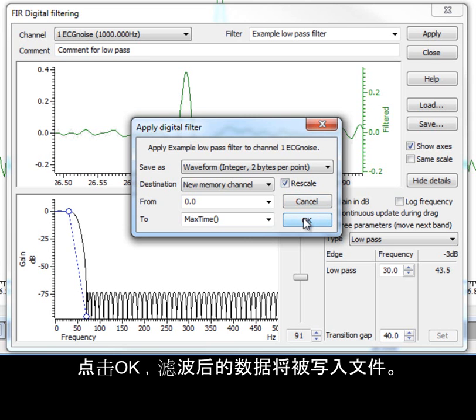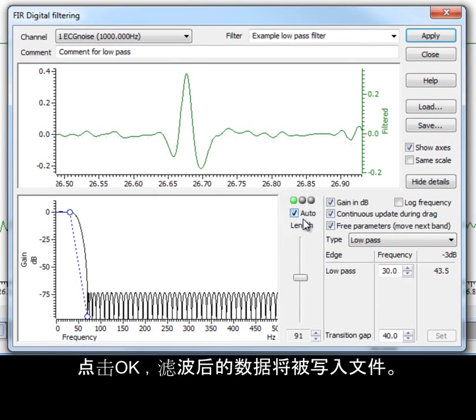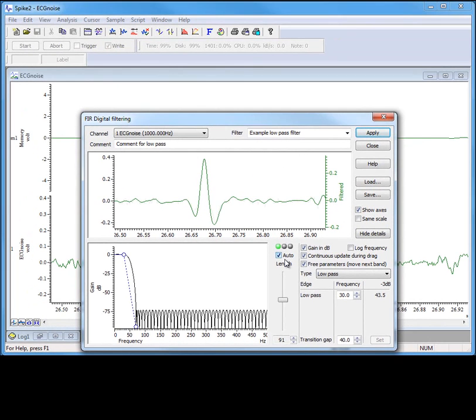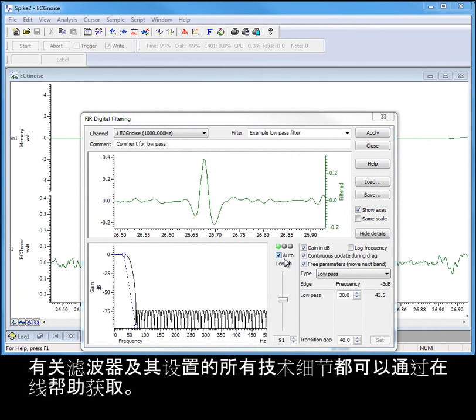Clicking OK then writes the filtered output to the file. Full technical details of the filters and all of their settings can be found in the online help.